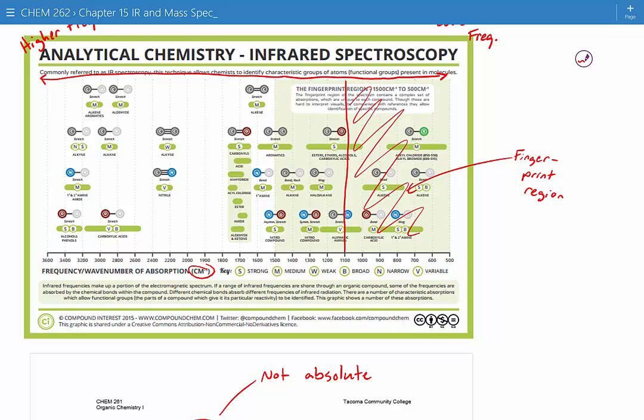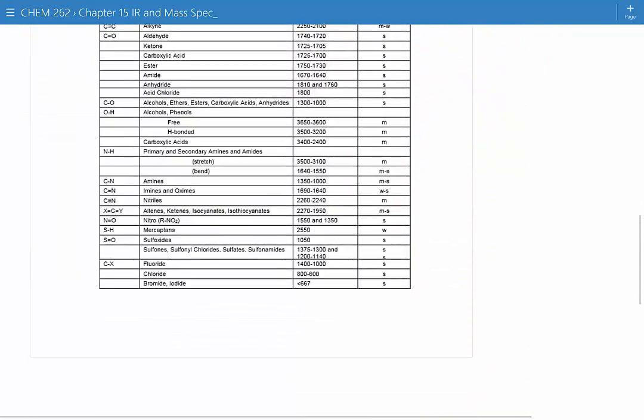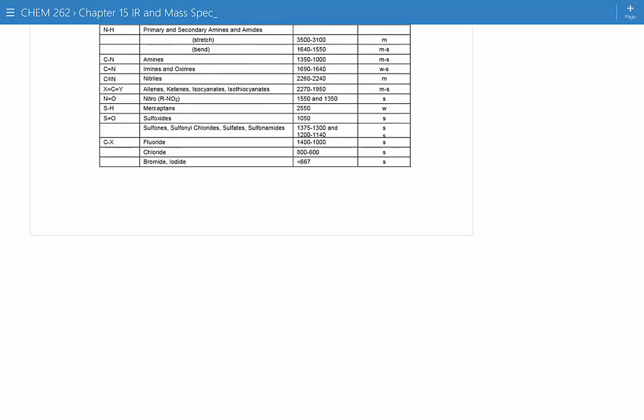It's very hard to interpret. But what it is useful for is matching spectra. So if you've got a spectrum that you took and you found a literature one online, you can literally overlay them and the fingerprint region should match. Just like police use fingerprint identification to find suspects. Exact same sort of concept here. So we can use wavelength really easily to help identify structures and various molecular features within molecules, or even deduce what our compound is.